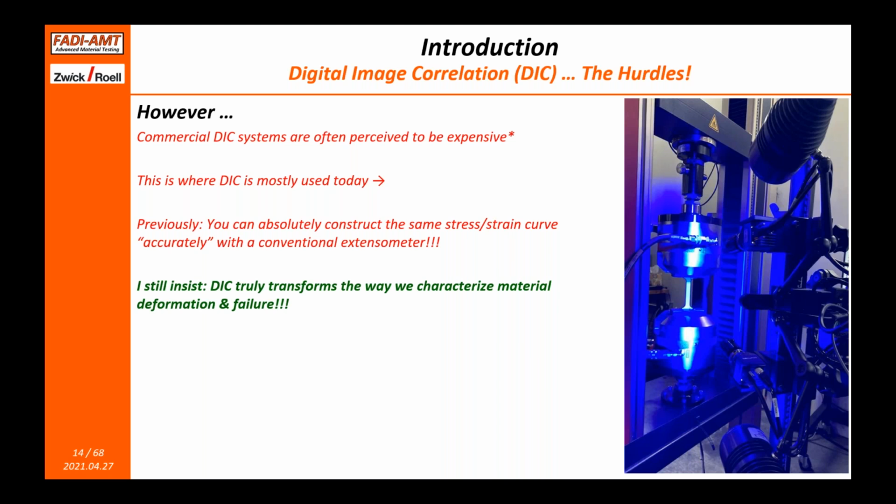And the first one is I still go back and insist on saying that DIC really enriches the amount and the type of data that we get from testing. So even though you can, to some extent, construct the same stress strain curves in a tension test, that doesn't mean that you shouldn't use DIC or consider using it, because the quality of the data that you get is, again, transformative.